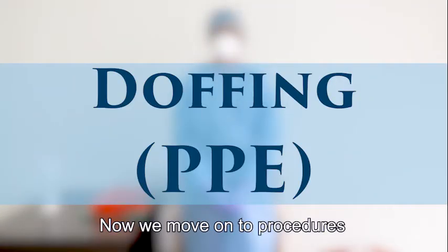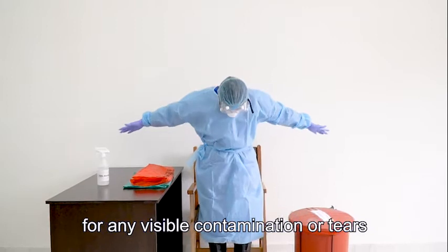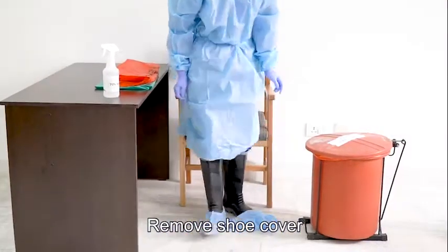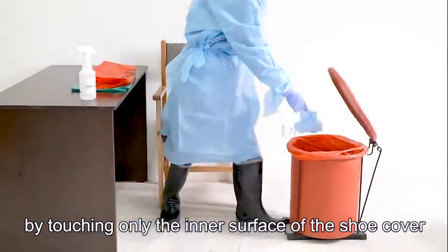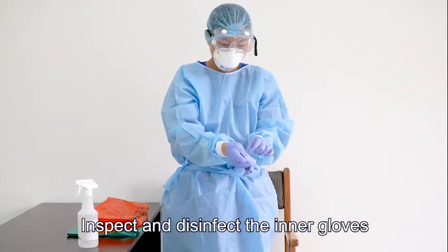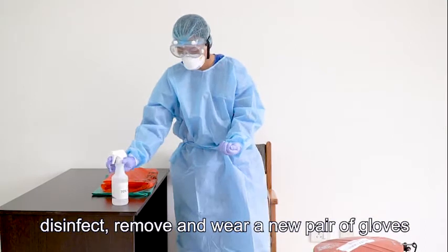Now we move on to procedures for removing and disposing of PPE. First, inspect your PPE for any visible contamination or tears. Then disinfect your outer gloves. Remove boot covers by touching only the inner surface of the boot cover. Remove your outer gloves. Take care not to contaminate the inner gloves. Inspect and disinfect inner gloves. In case your inner gloves are contaminated or torn, disinfect, remove and wear a new pair of gloves.